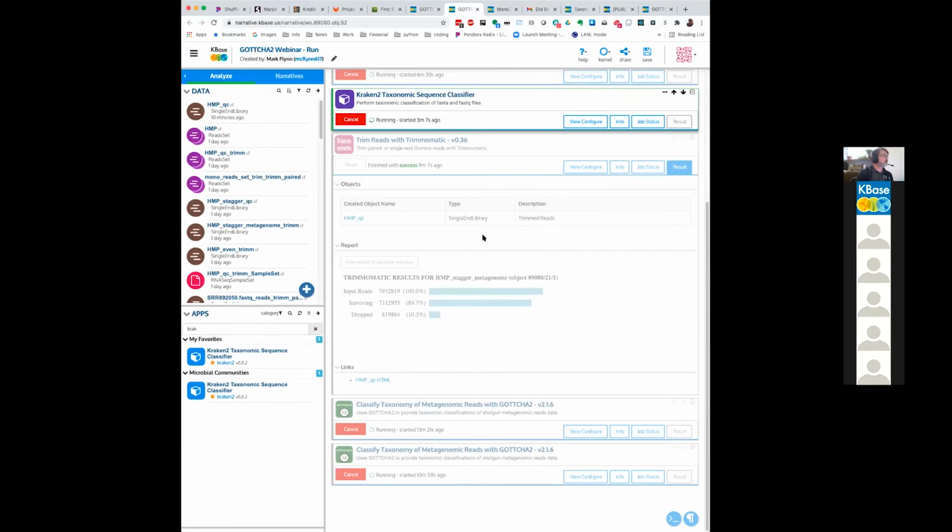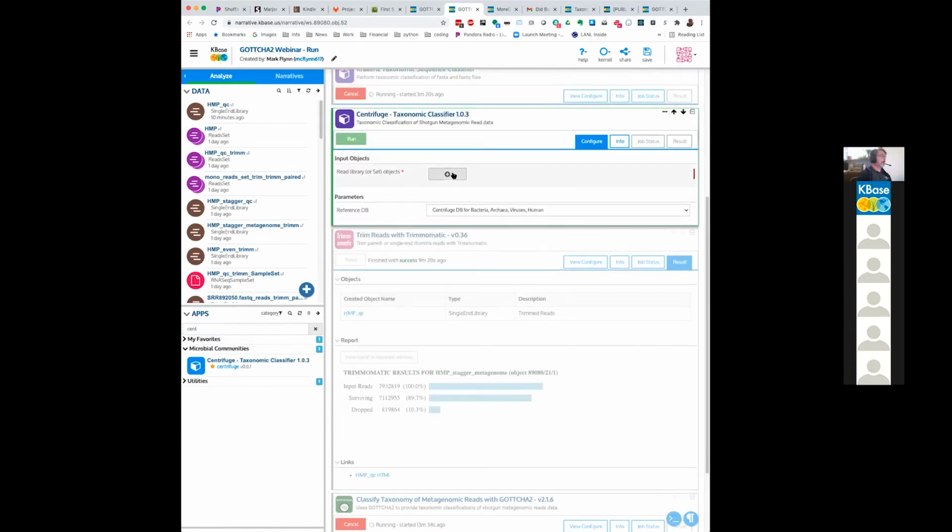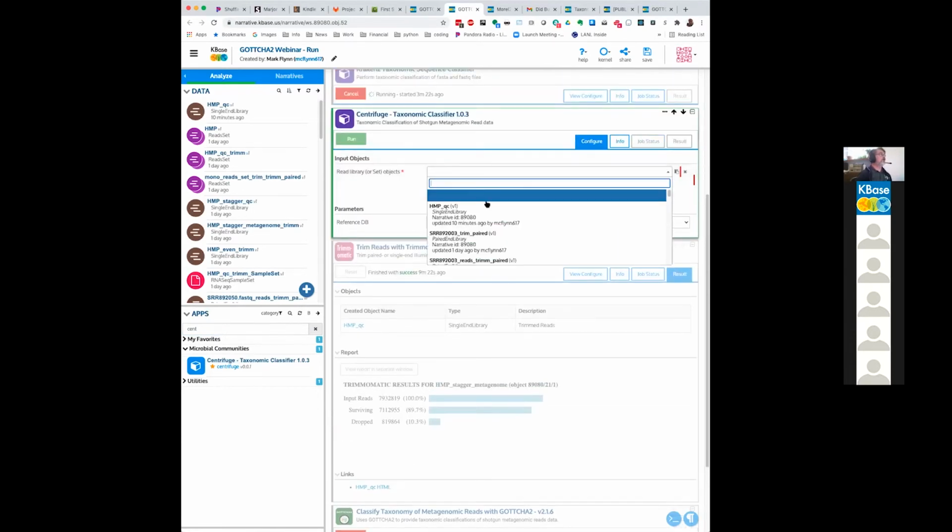Okay. All right, so next we'll look at Centrifuge. And you add your sample.